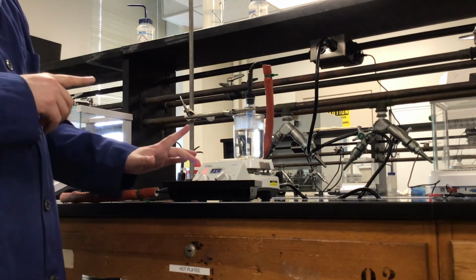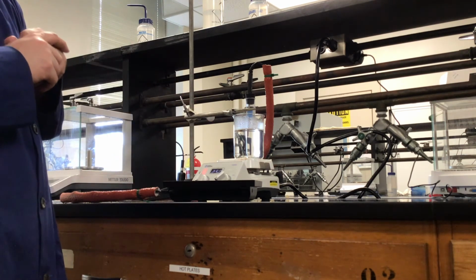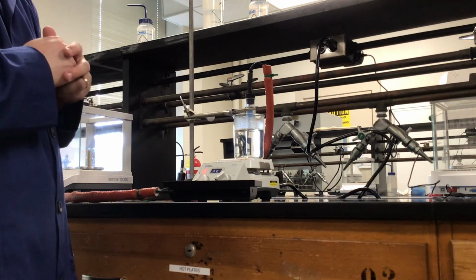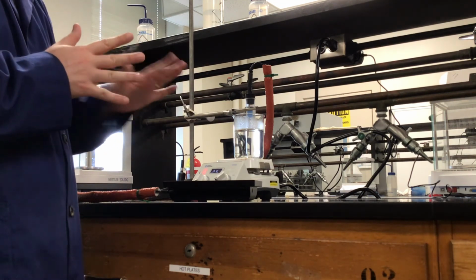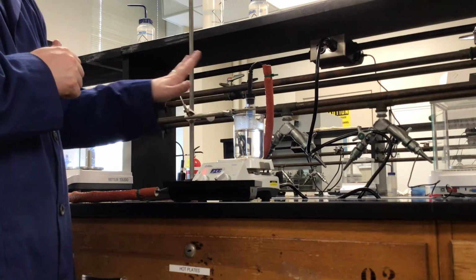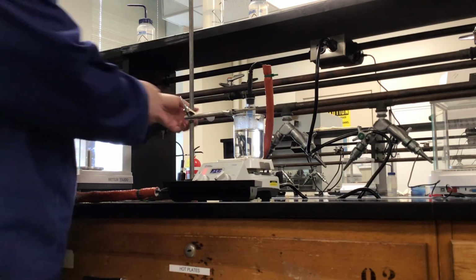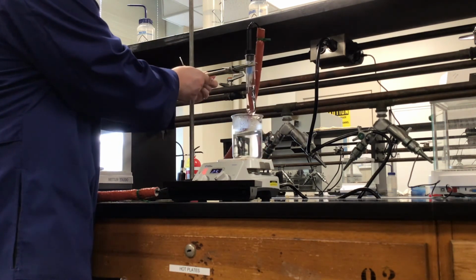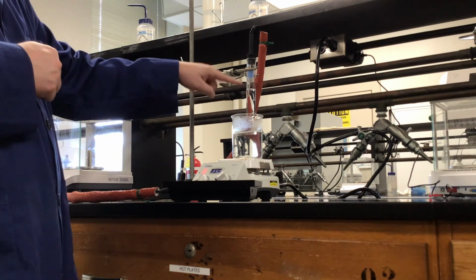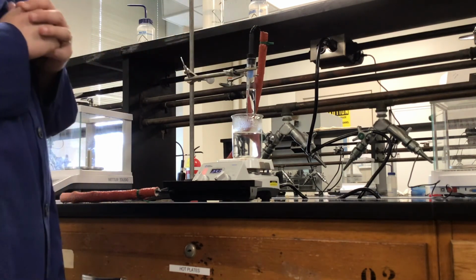And once it's very clear that our plateau is definitely flat and we've got some boiling going on in our test tube, we do not need to wait for this stuff to actually evaporate or boil out. In fact, keep a very close eye on it as you get close to the boiling point, because once you're very close, you're going to want to take this out of your hot water bath. You can just raise the clamp up so that the test tube comes out of the hot water bath, so that this stuff doesn't boil too vigorously and shoot out one of the extra empty holes up here in these stoppers.